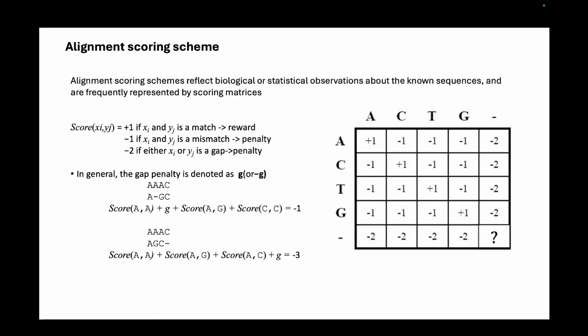A one base pair change should not be equal to a two base pair or 50 base pair change. The impact should not be the same. So your scoring system should be made in such a way that you consider all these different variations that can be possible. Okay, this was just an example of a simple scoring system, how you can use that to do your alignment.